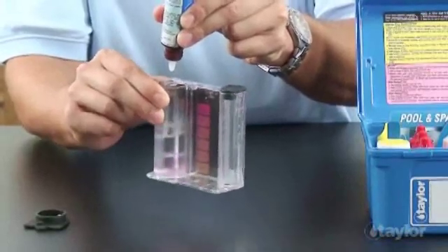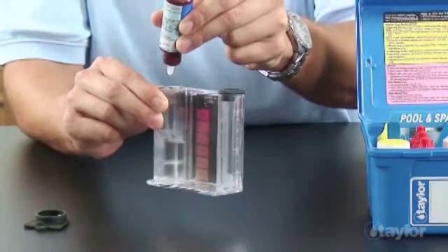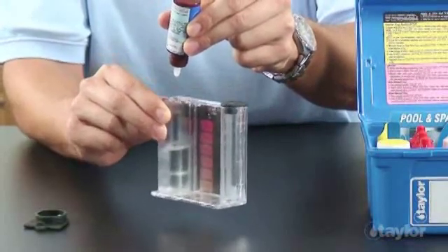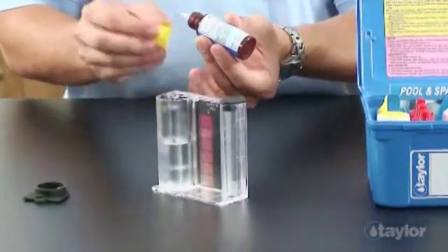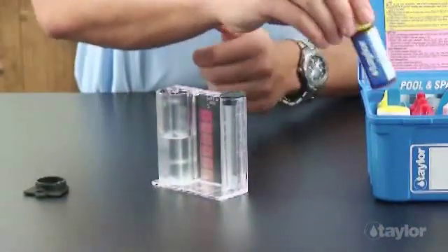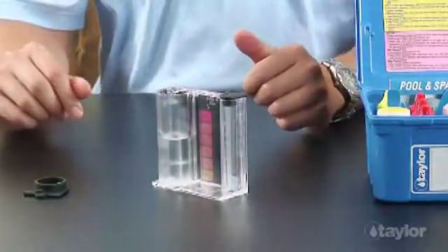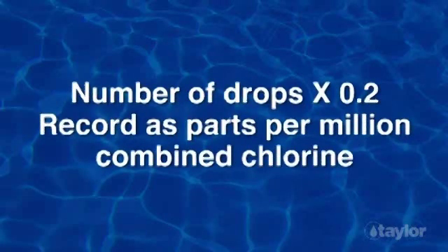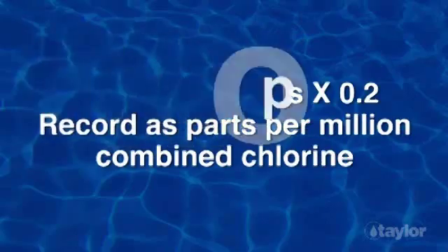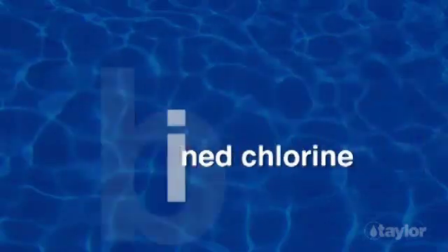Add one more drop of titrant after the endpoint to be certain the color change is permanent. If the color remains unchanged, do not count this drop. Multiply the drops expended in the previous step by 0.2 and record as parts per million combined chlorine.